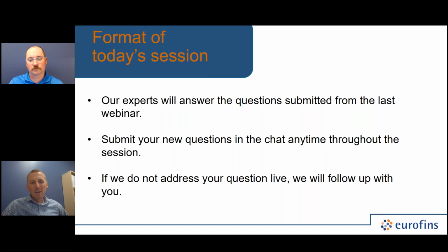All right. So let's move on to one future-looking question, at least what I think is a future-looking question. Are you able to differentiate species of probiotics in a blend by flow cytometry? Good question. Yeah, I agree. That is a forward-looking question.